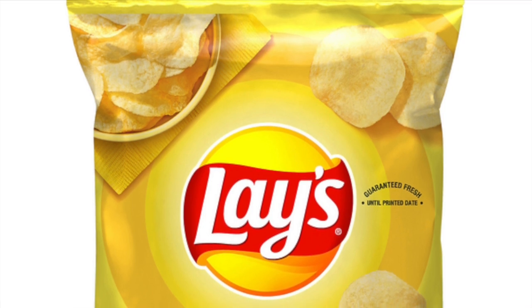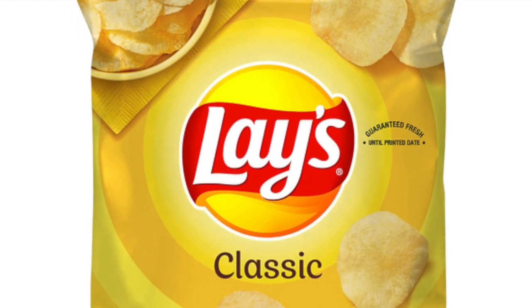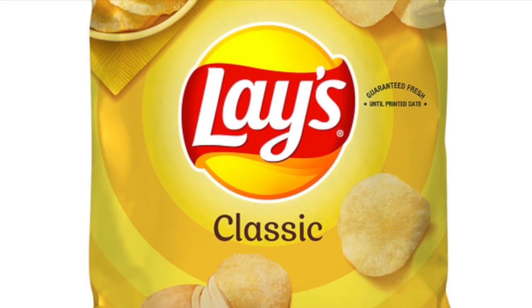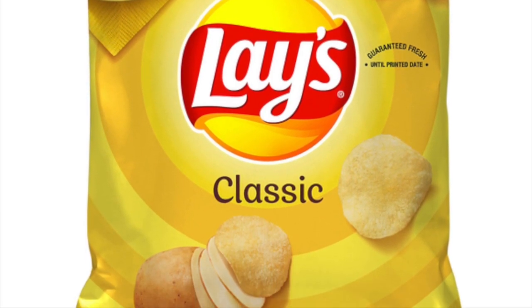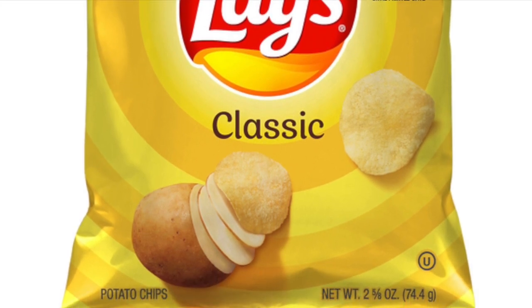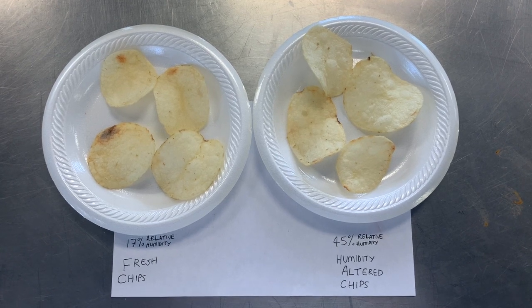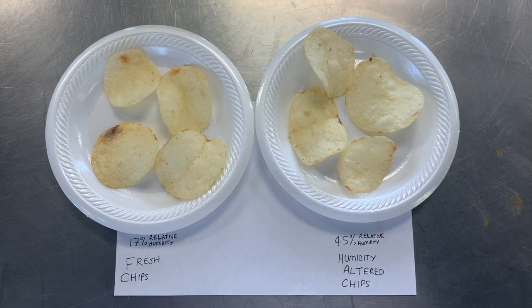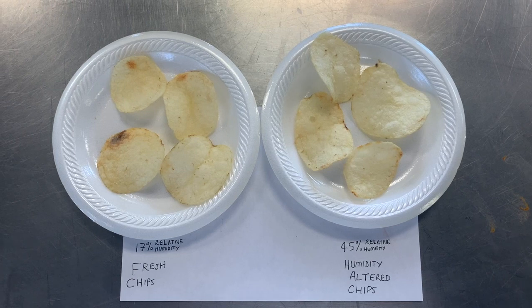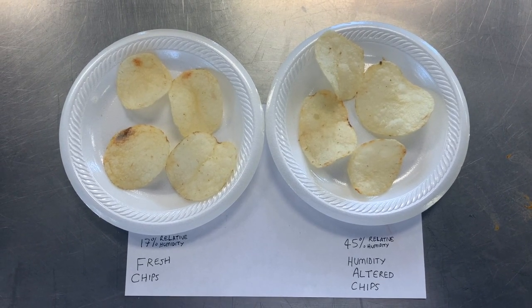Step 2. Sample preparation. In this experiment, I'll be comparing the crispness between two batches of Lay's classic potato chips. The first batch of chips were fresh out of the bag at a humidity of 17%. The second batch of chips were prepared by leaving them in a 66% humidity chamber for 5 hours. The second batch of chips had a humidity of 45%.